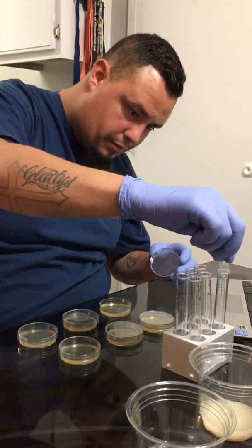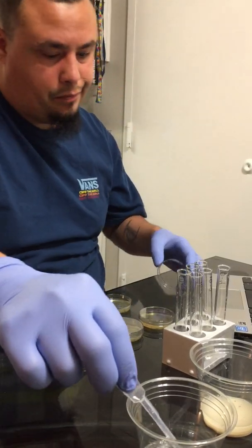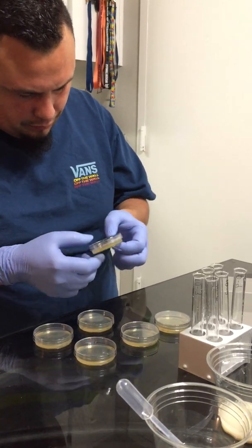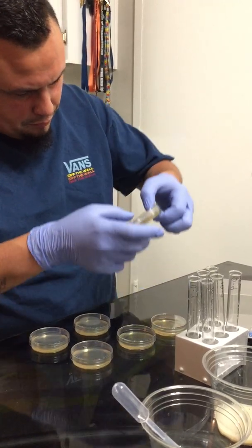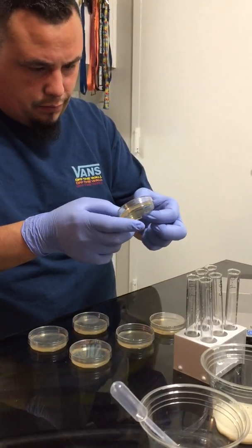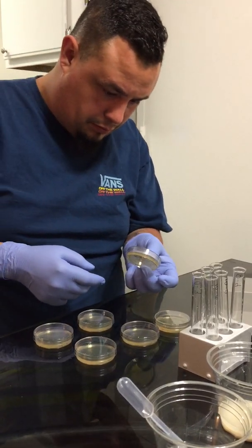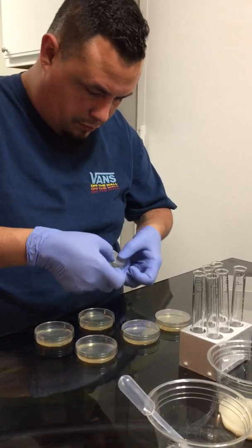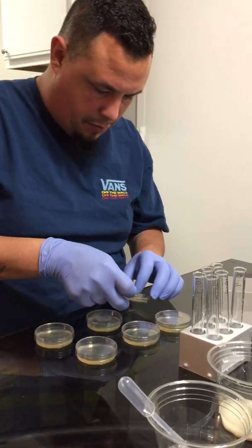Hard to drop, really. There we go. And again, just gently swirling it. Four.